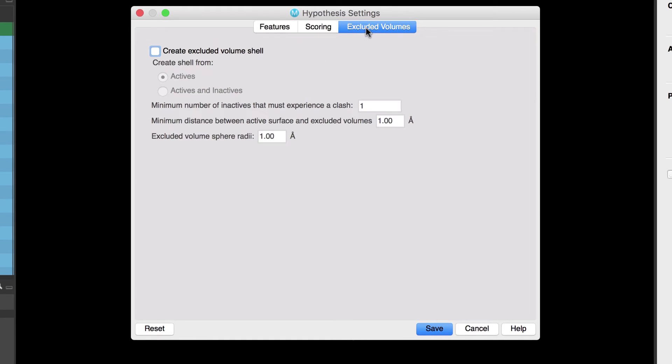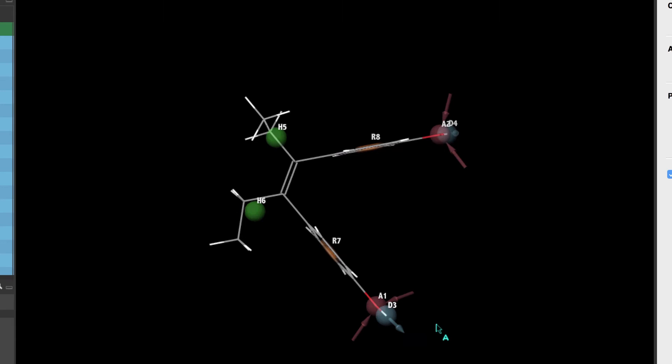In the excluded volumes tab we have the option to create an excluded volume but in this example we'll leave it unchecked. So let's click save.